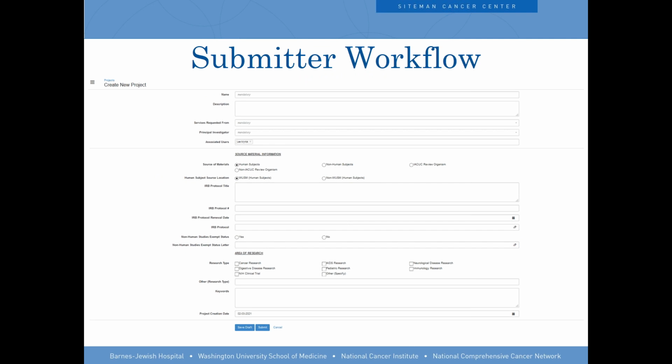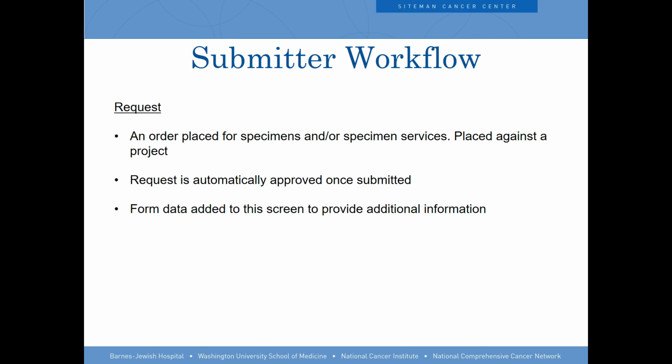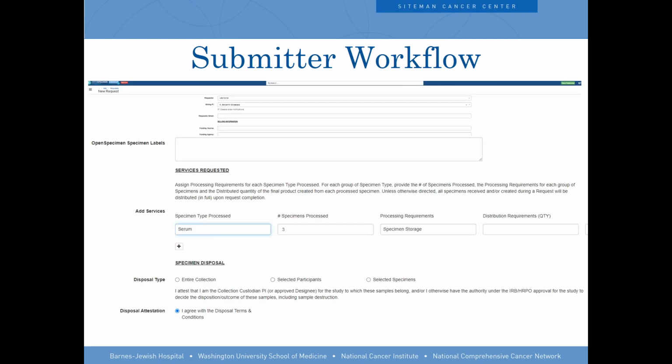And here's another screenshot just to give you a very high level view. This doesn't exist out of the box. This is just the form that we created and what it looks like. So an end user would go in here and see this when they're creating a new project. This is blown up a little bit, so you can see some of the fields. And then again, the project's done. Now they're creating a request. Pretty straightforward there. Their requests are automatically approved once submitted, and this is what that form looks like.